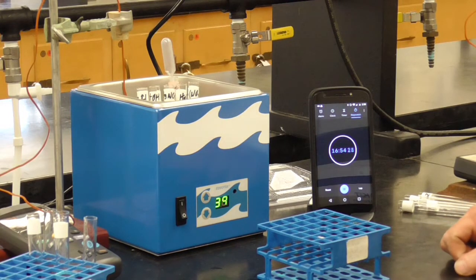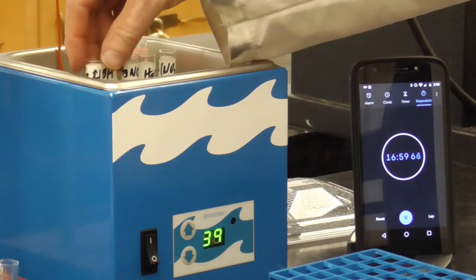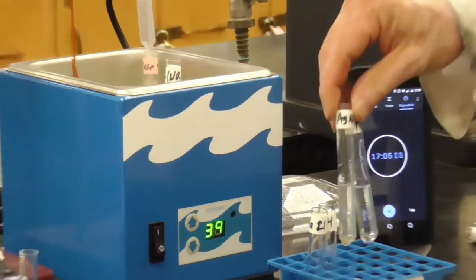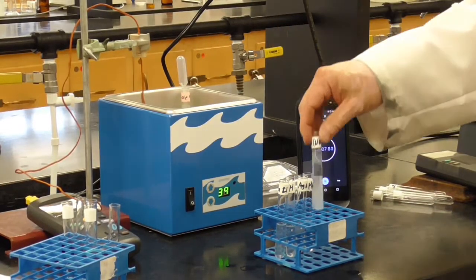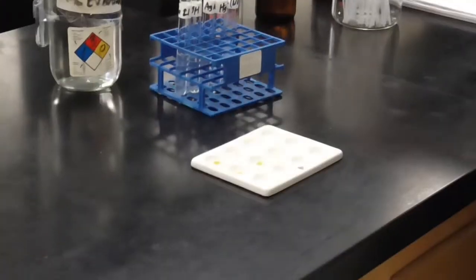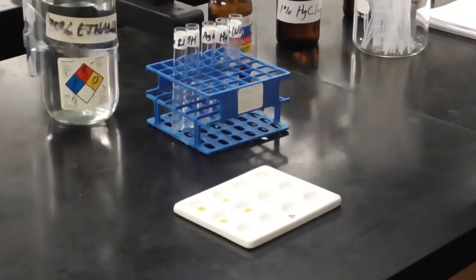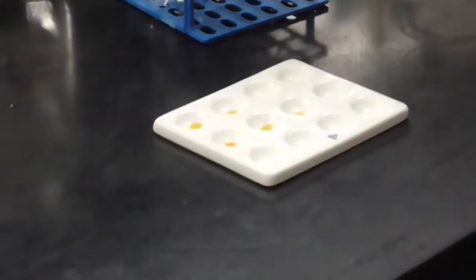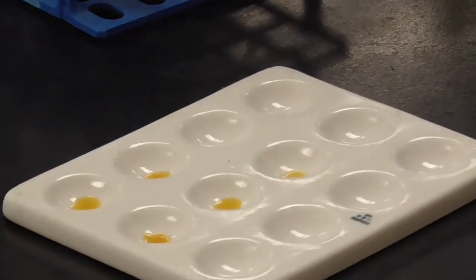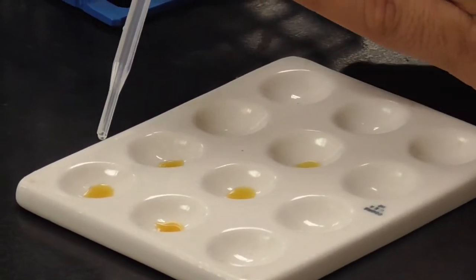Okay, our test tubes and solutions have been sitting for at least 15 minutes. Let's go test them. So bring them out of the 37 bath. All right, let's go find out what worked. Okay, as usual, we'll put 4 drops of each one and the indicator. So first of all, the one with the sodium chloride, salt.